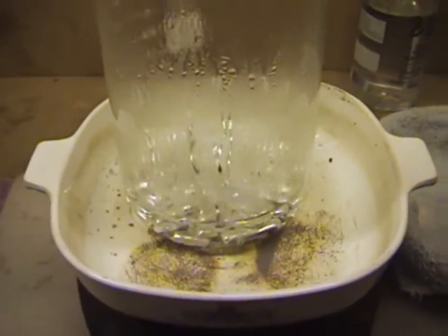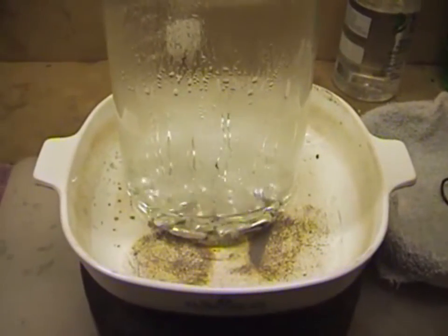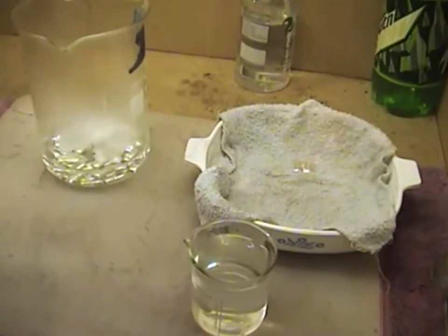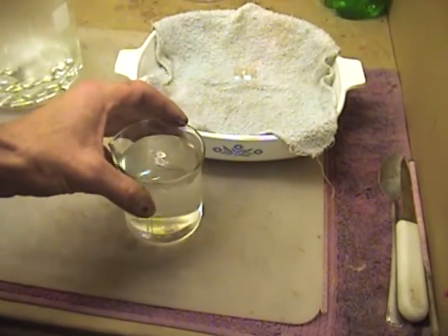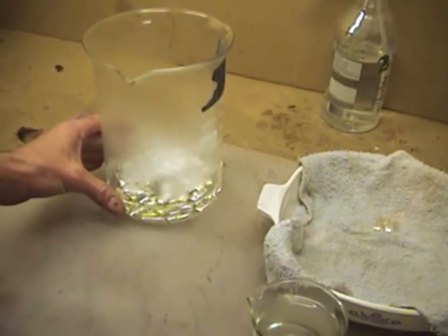Alright gentlemen, we're back again — it's been about 30 minutes and our bars have been lightly simmering in the sulfuric acid and water solution. Let me see if I can get you a shot of just how pretty the bars are — you'll see them when they come out in a minute. They've been sitting in there about 30 minutes. Now what you want to do is turn this off and give it about 20 or 30 minutes to cool down, then we're going to come back and take our bars out and clean them.